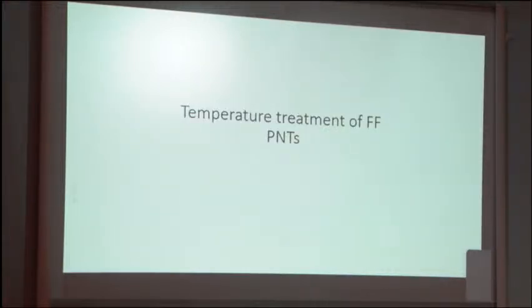Okay, what is the main problem for investigation of organics by atomic force microscopy? It's not so stable with temperature, and it's a relatively soft material. During atomic force microscopy measurement we have mechanical interaction, and the recommendation is to use a softer cantilever.